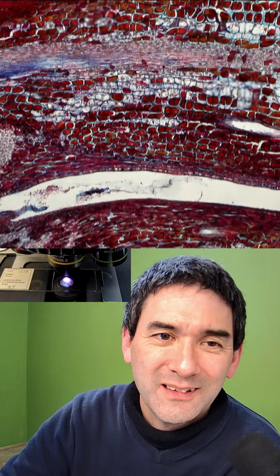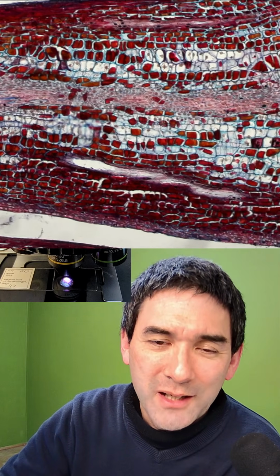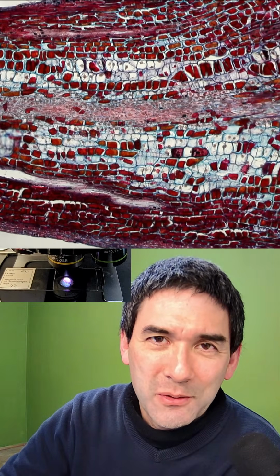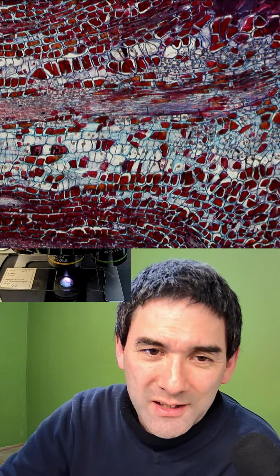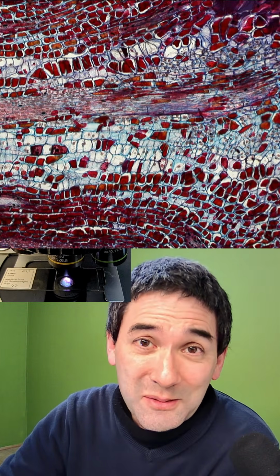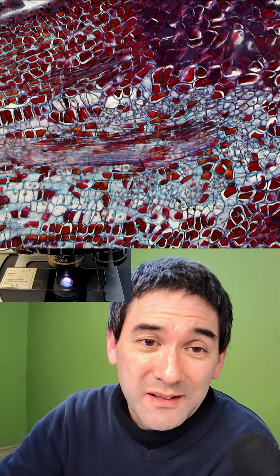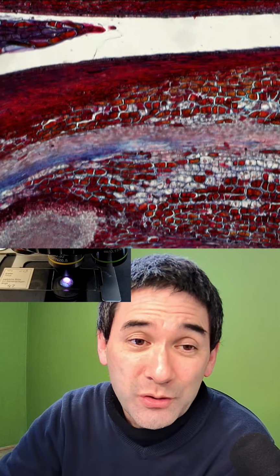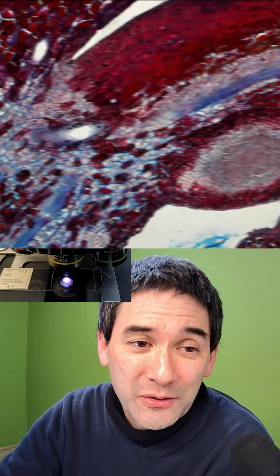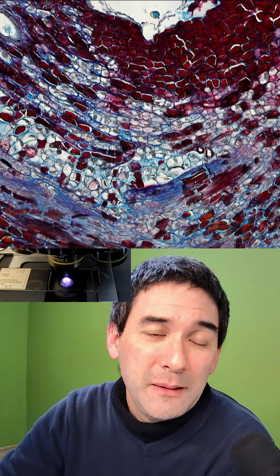Yeah. So one of the nice things, because you're talking about slide collecting right now in the chat, one of the nice things also about microscopy is that you can essentially do it in different directions. You can go into collecting slides, historical slides or modern slides, doesn't matter, or people like to sometimes do microscope maintenance and repair them. Others like to use it more for casual nature observation, collecting samples in nature and the environment, and then just seeing what's there.